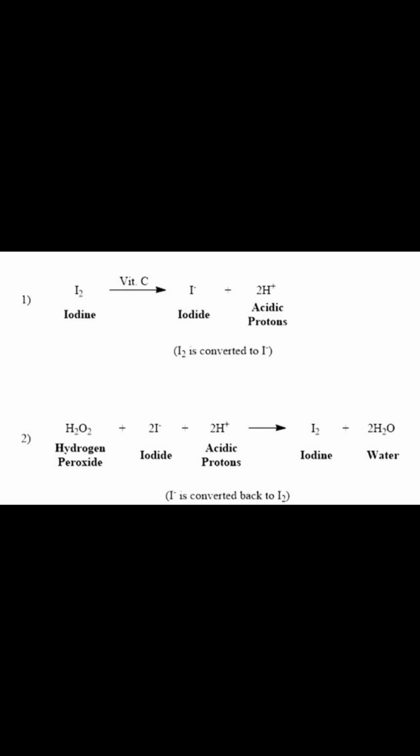The role of the vitamin C is to act as a reducing agent that stalls the hydrogen peroxide, preventing it from reacting with the starch right away. The color changes when the vitamin C is completely used up and the iodine is freed up, and it starts reacting with the starch and turns into the dark color that we get at the end. And there's one variable, which is the quantity of substance that you add, and depending on the quantity the reaction will take longer or shorter, so that's the only variable.